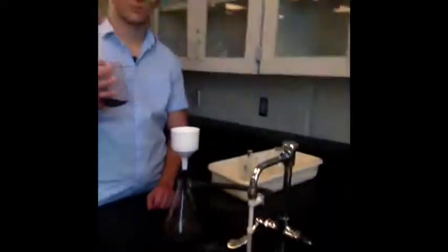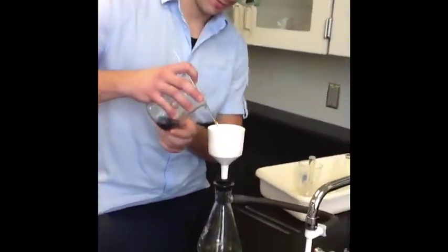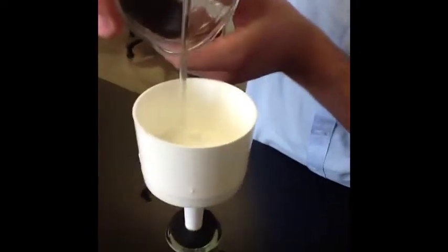So what's gonna happen right now is Nick is going to pour the solution in there, and it's gonna filter and all that good stuff. So let's watch. Action. Put your whole hand around there, and I'll be able to feel it. Don't. I'm gonna grab the very top. Very carefully, watch it.